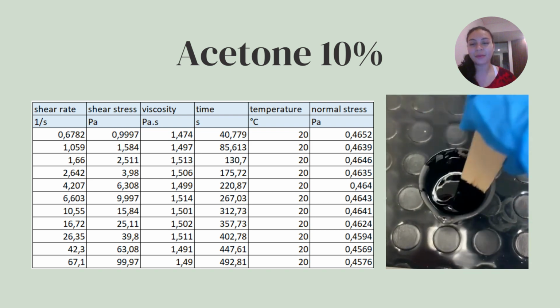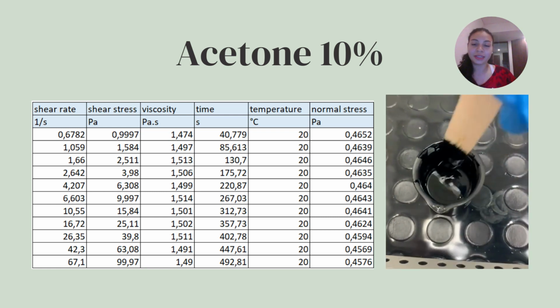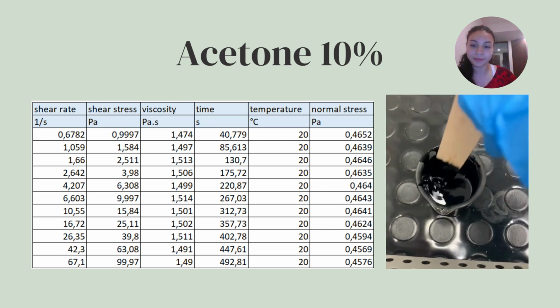In the case of the sample of crude oil with acetone at 10%, we obtained this table with the rheometer. We can also see in the video how the consistency of the sample changed by adding this 10% acetone.